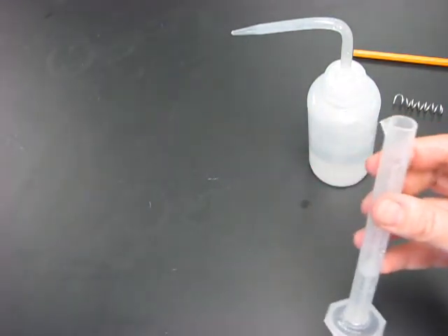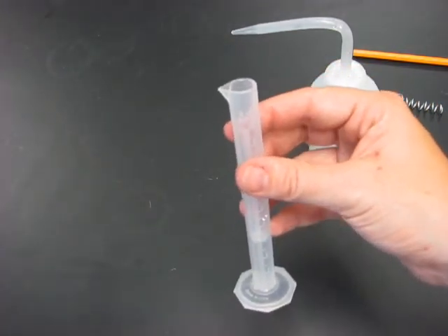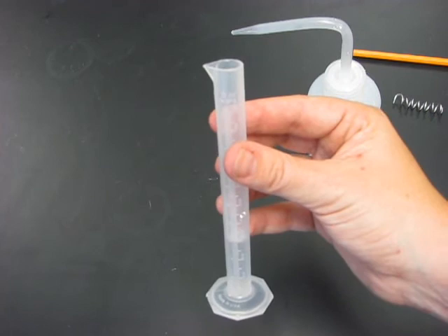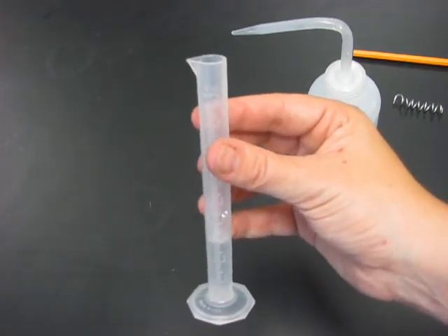In step number 13, it actually says 10 milliliters of ethanol. If you could please correct that, cross off the 10 milliliters on step 13 and make it say 5, I would appreciate it. It will take a long time for it to filter through if you put 10 milliliters in.